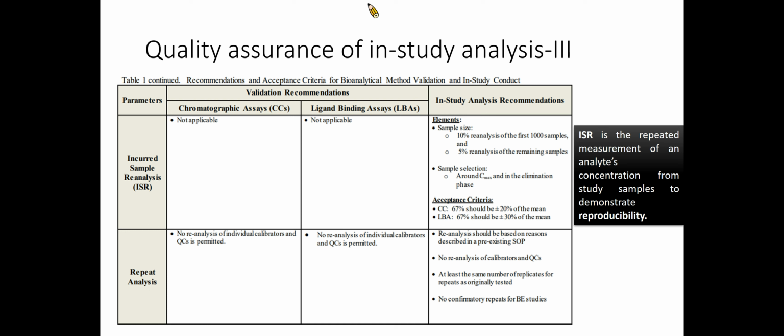Assays of all study samples of an analyte in a biological matrix should be completed within the time periods for which stability data are available. The internal standard response should be monitored for variability and retention time shift, and its impact on the accuracy of the estimated unknown sample concentration, if any, should be addressed.